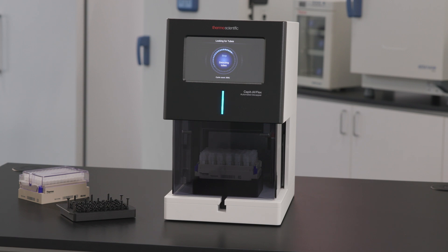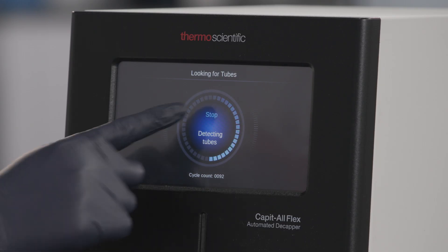You can abort this operation at any time by pressing the stop button in the middle of the screen.